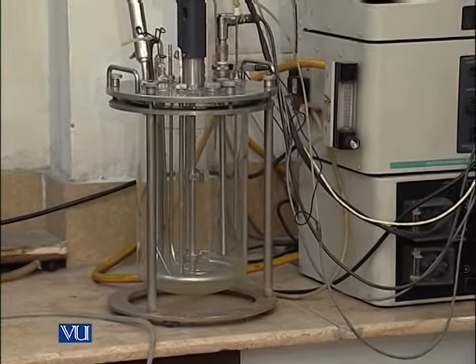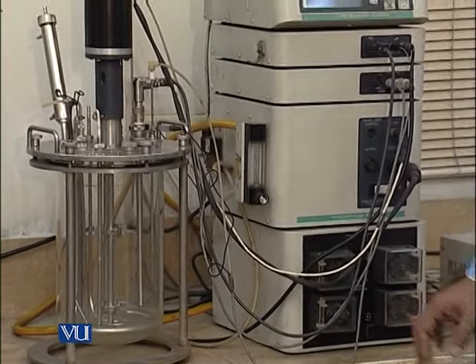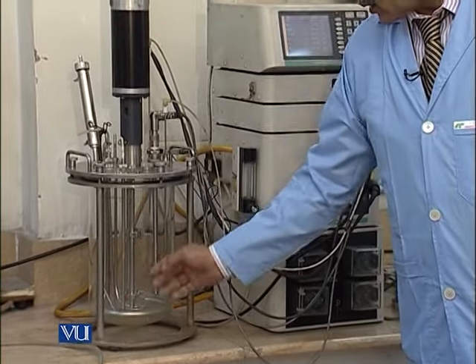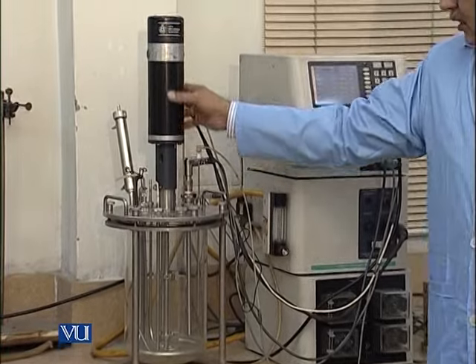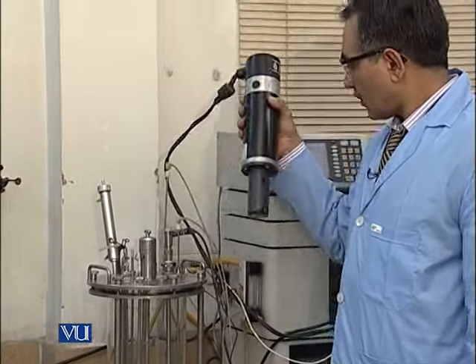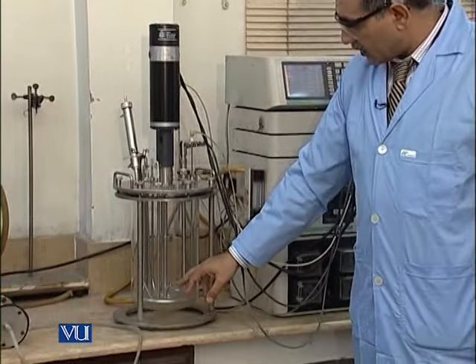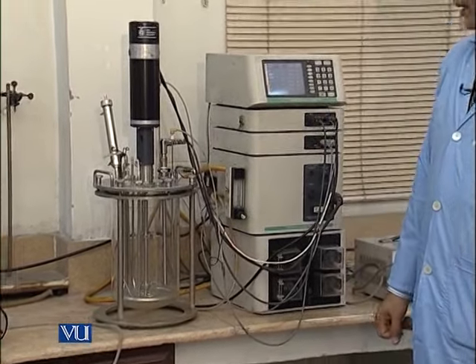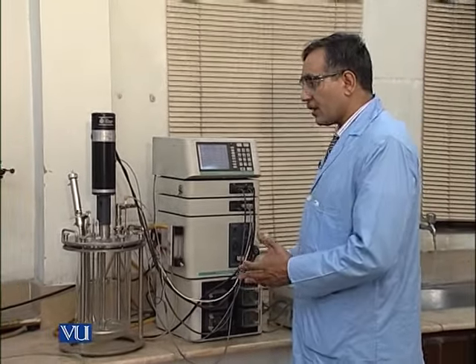So, first of all, along with this main assembly of the fermenter, as you know, the basic parts of the fermenter are this body vessel, inside is an agitation mechanism along with this motor, and also some impellers, and then the sparger. So, there are some accessories along with this fermenter.